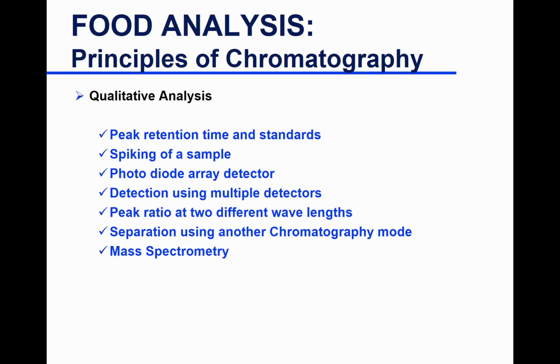So it seems like you have maximum absorption, let's say here. This is, let's say, lambda 256. So here it's telling me at 200 there is no absorption, at 220 there is no absorption, and then at whatever, 240, my solutes start to absorb light, and then it absorbs maximum light at 256.